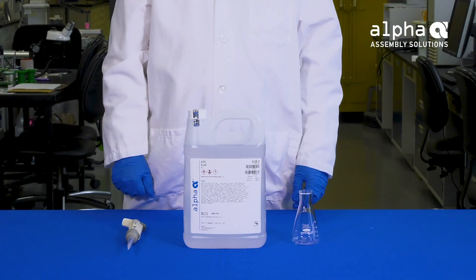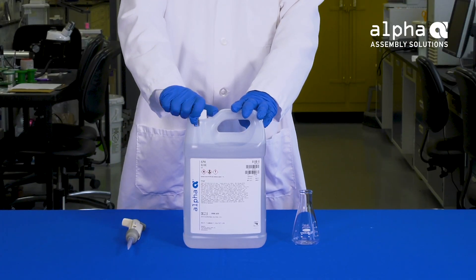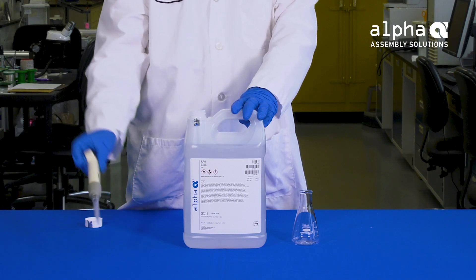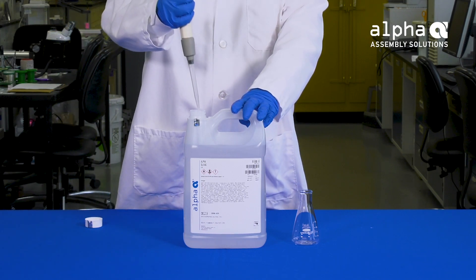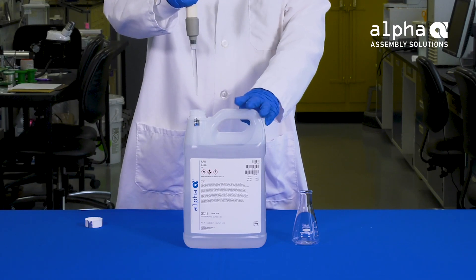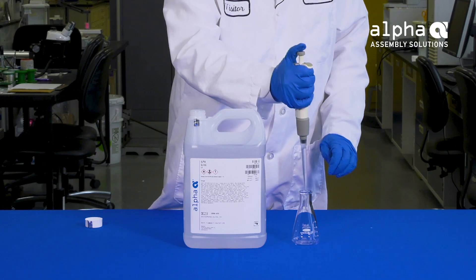In our first step, we're going to transfer 5 milliliters of flux to be tested into a clean, dry, 125-milliliter Erlenmeyer flask. The volume of this test sample is critical to ensure accurate measurement results. The 10-milliliter graduated cylinder included with the kit can be used; however, a 5-milliliter pipette or syringe is strongly recommended. Today, we will be using a precision 5-milliliter pipette to acquire the test sample.